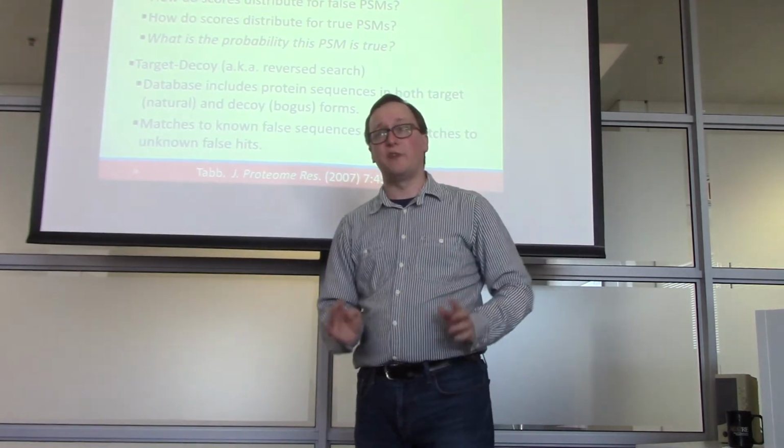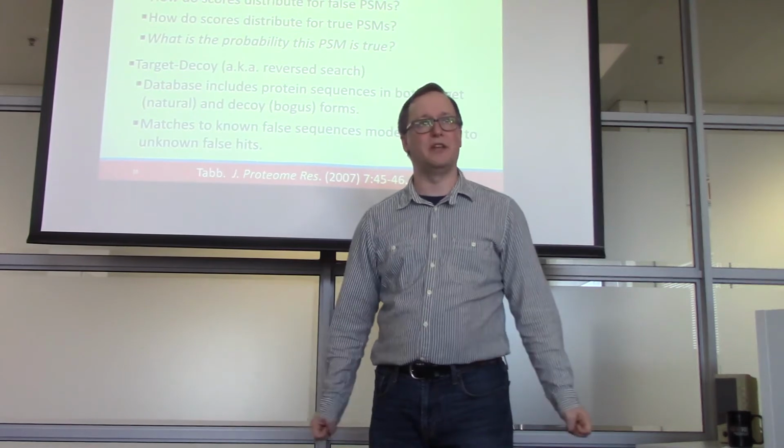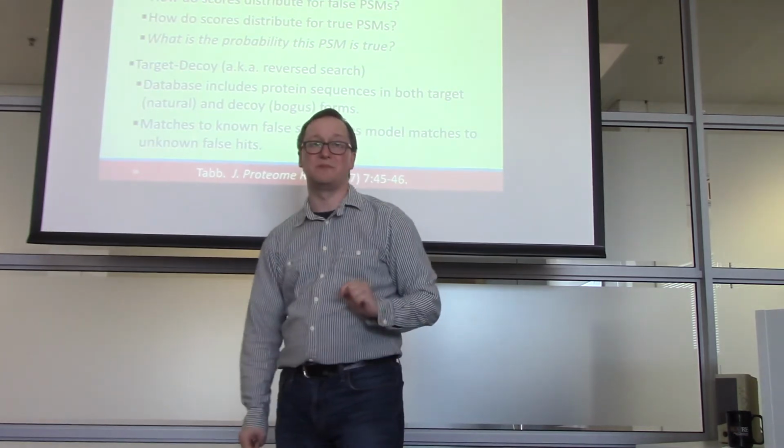Now, one of these methods is fairly computationally complex. The other one is fairly computationally simple. And you might think, well, gosh, I guess we just have to use the simple method then. But the reality is that there are times when you need to know the accuracy of individual PSMs.